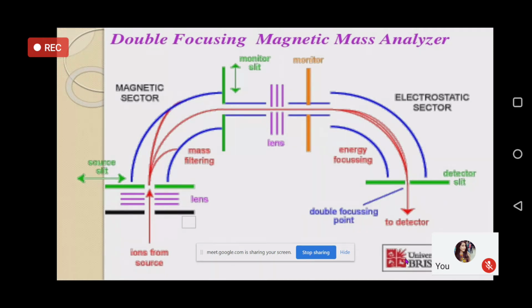So the same point is assumed here, that the fragments have different velocities, a distribution of velocities, what is called the Maxwell-Boltzmann distribution, and therefore even those fragments which have the same m/z value may not possess the same velocity. So when you are applying the curved electric field, the ions have different m/z values and different velocities. So the situation over here is that we have ions or particles in the beam having different m/z and different velocities.